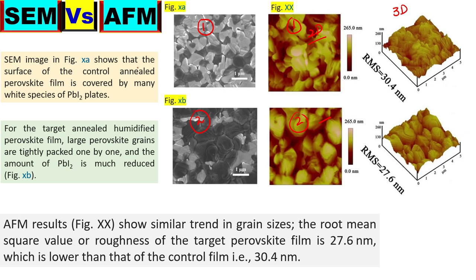So let's get started. We can see here that sample 1 is basically the pristine perovskite sample. The first thing we can see is the grain size. This is the most important thing when we are interpreting scanning electron microscopy images. We can see that there are small grains. This is one discussion we can write in a research paper.